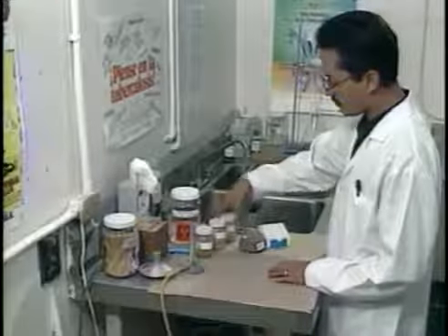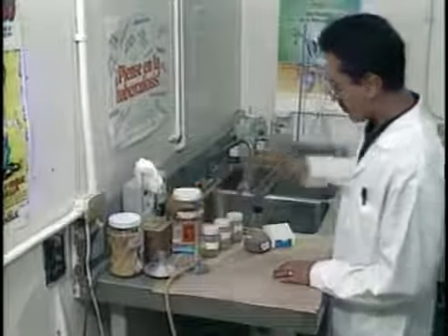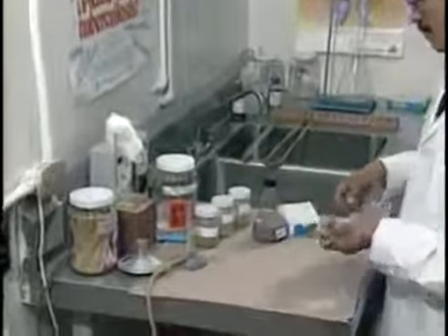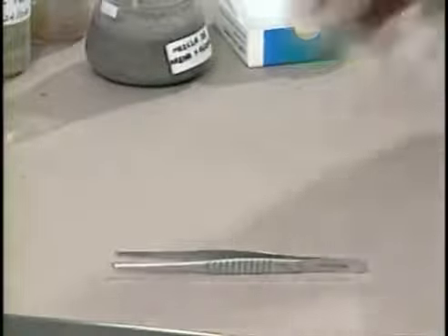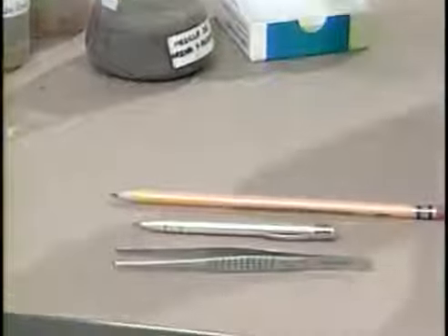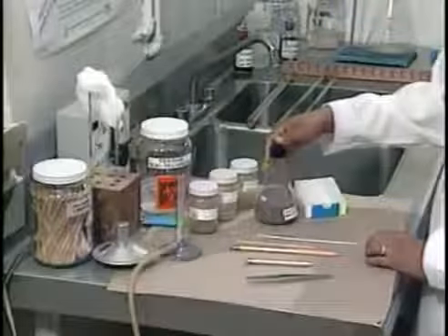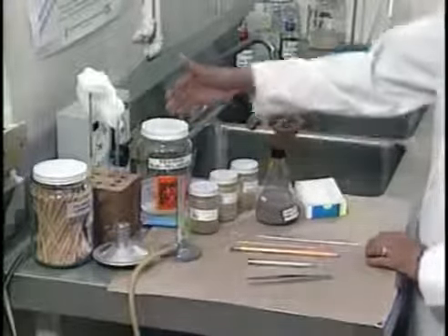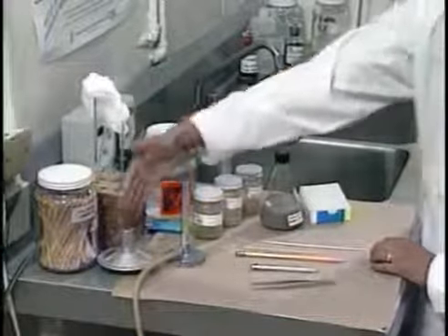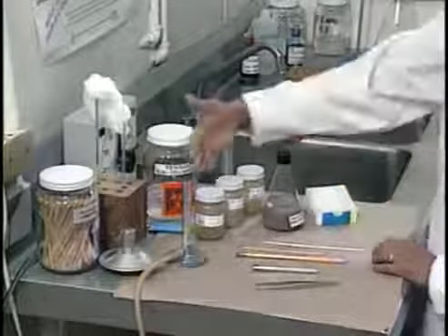To ensure a safe and consistent workflow, always arrange equipment and materials in the same way at the workbench. The following supplies are required: forceps, a diamond marker or lead pencil, wooden applicator sticks or loop, a sand alcohol jar if a loop is used, a discard container with disinfectant, a Bunsen burner or spirit lamp, a box of new slides, and specimen containers.